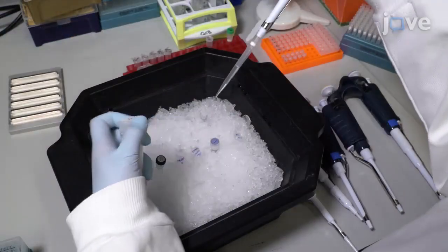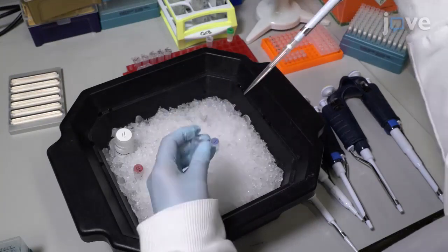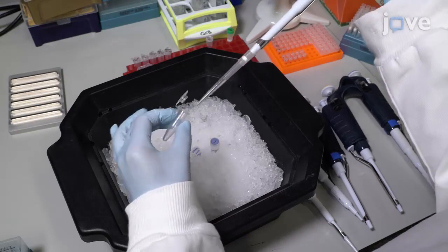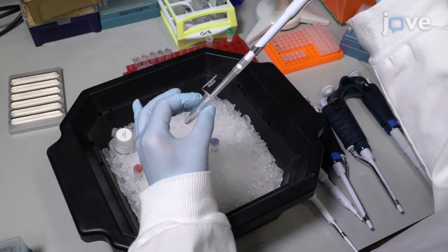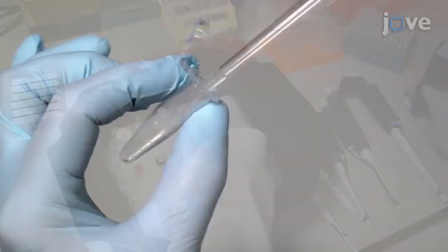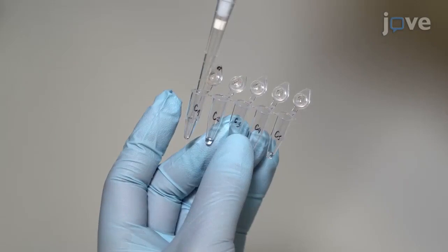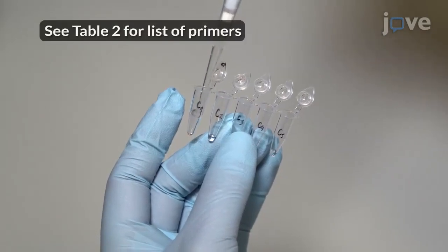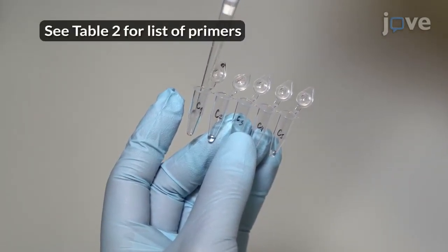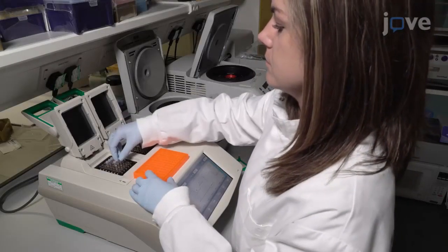Start by preparing the PCR mix for each template. Combine buffer, dNTPs, unique forward primer, template plasmid with the synthetic carrier gene, and fusion polymerase according to manuscript directions. Mix reagents by pipetting. Add 90 µL of the PCR mix to 10 µL of each reverse primer and mix. Refer to the manuscript for thermocycling conditions.